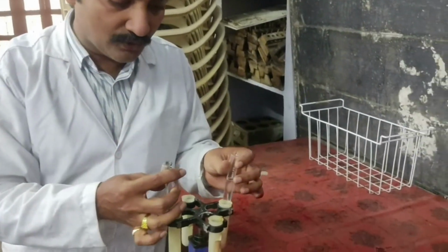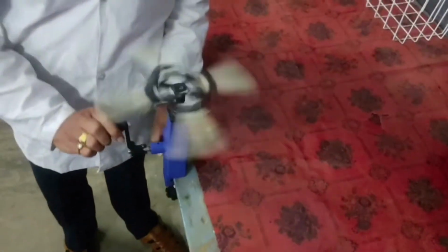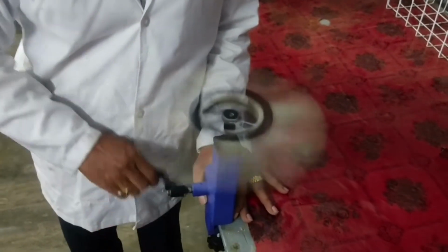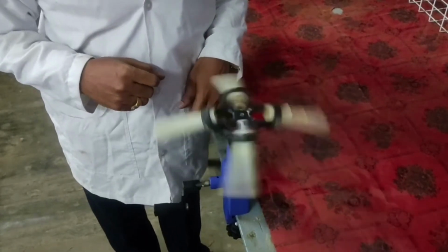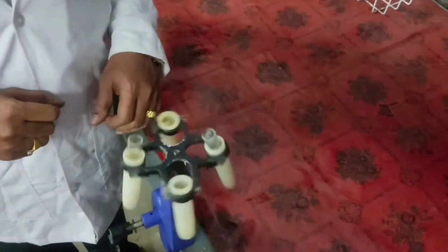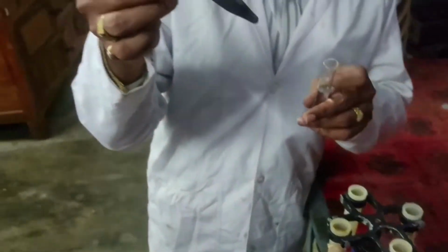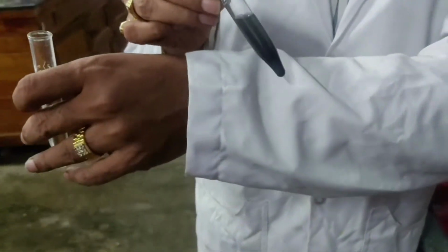Now I am centrifuging. See, I am putting the tubes in the opposite holders of the centrifuge machine. Now I am centrifuging the mixture. For a change, we are using a hand centrifuge machine. The centrifuging is complete. Let us see the residue that we have obtained. So this is the residue I have obtained. You can see this residue against a white background.